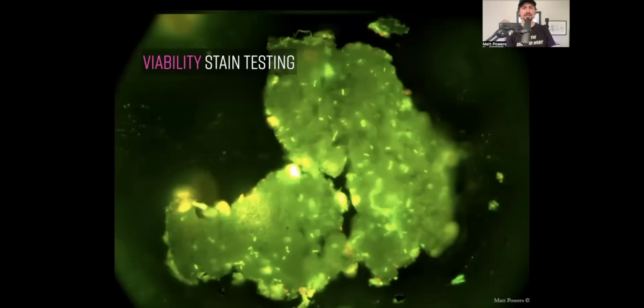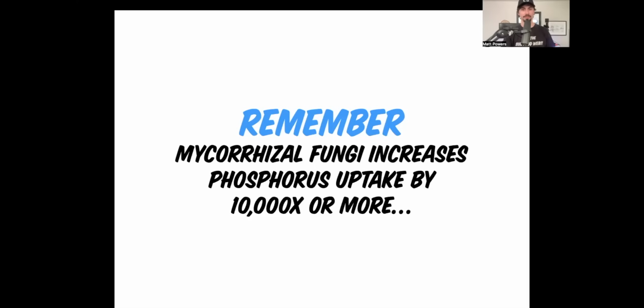Can you see the tetrads and the sarcina? It's all there. And that's the thing, we normally don't see the microbes with this much clarity in context. But because of the new tests, because of the new methods, everything is changing.